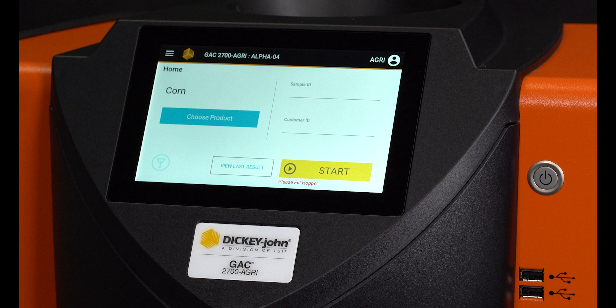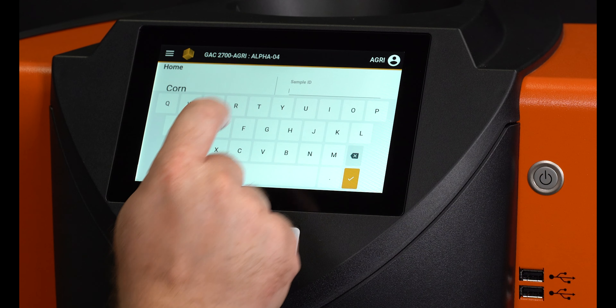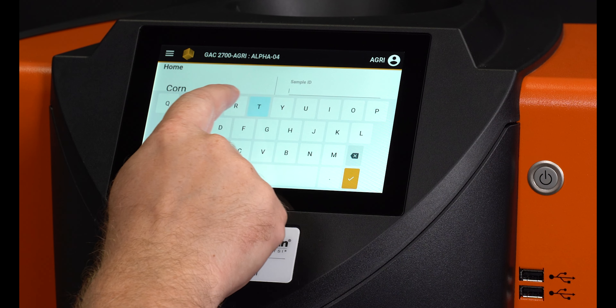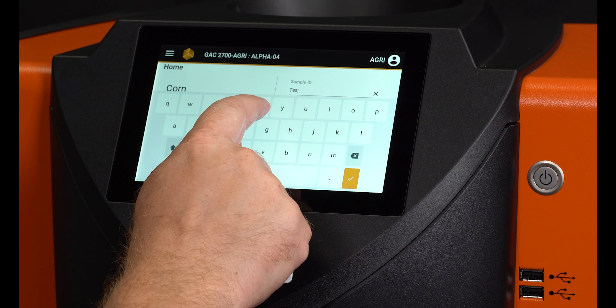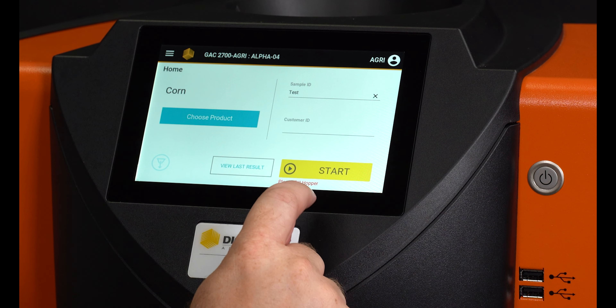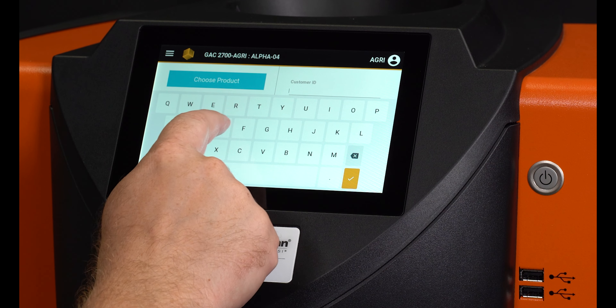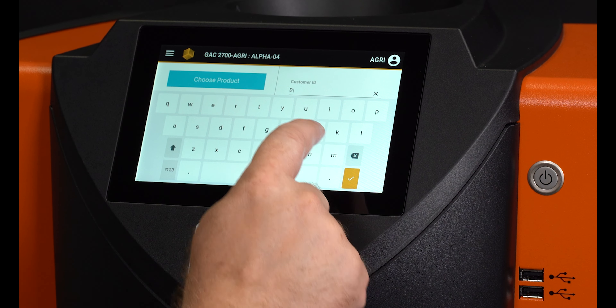If a sample ID is desired for tracking identification of the sample, press the text field under Sample ID to bring up the keyboard. Then you can type the ID and press the orange check mark to save. The same can be done with the customer ID.